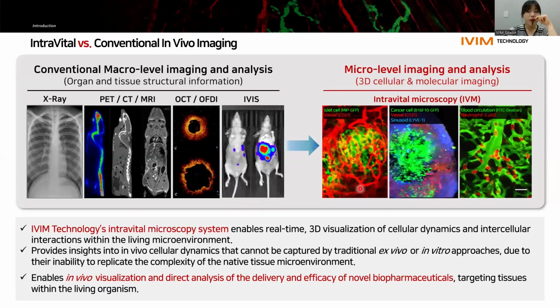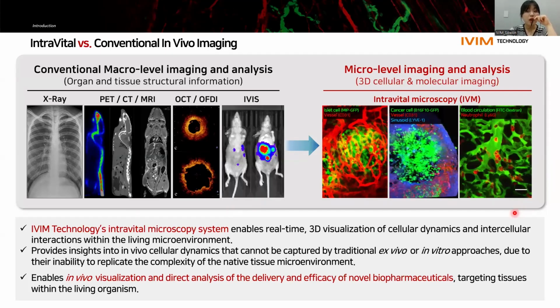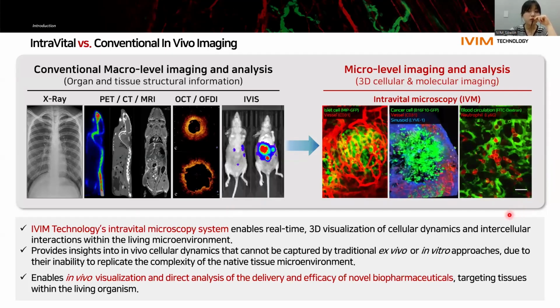Intravital microscopy goes beyond these limitations. It offers live, single-cell level visualization within intact tissue, allowing researchers to capture biological phenomena that were previously inaccessible.